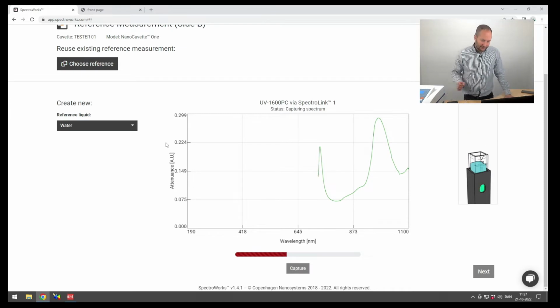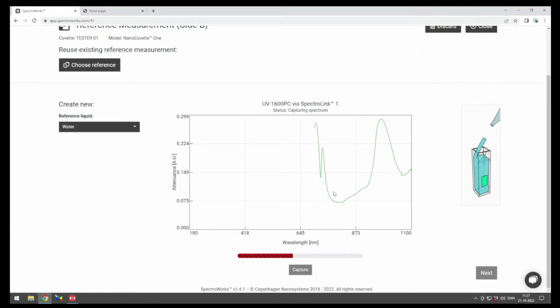The absolute lowest that we recommend people using our technology is that you look at the valley here, around the 800, and then we see these features here, and then it gets down to the 600. So you should always ensure that you as a minimum have from 600 to 800 in order to get a data set, but every time we cut away some of the other features, we remove the accuracy, precision and reproducibility of the platform.